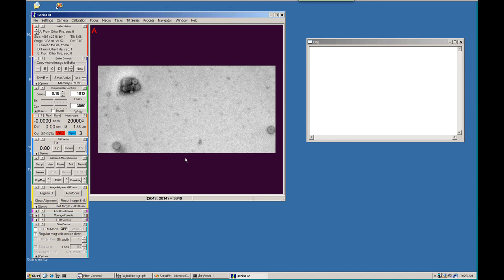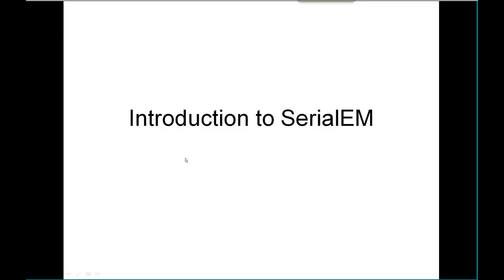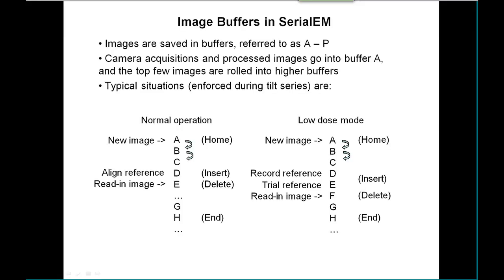Rather than displaying images in multiple windows, we have a single window that displays multiple buffers. You can scroll through the buffers with hotkeys and by other means. These buffers are referred to as A through P.